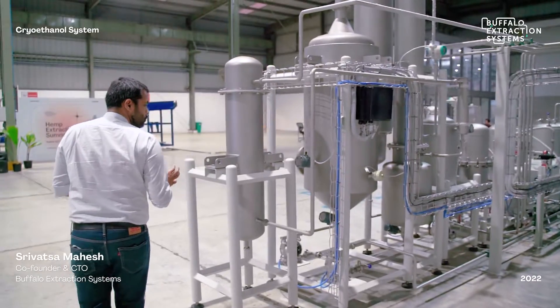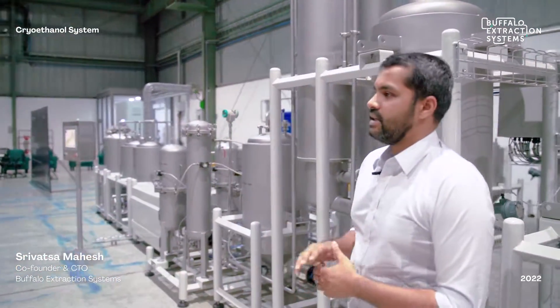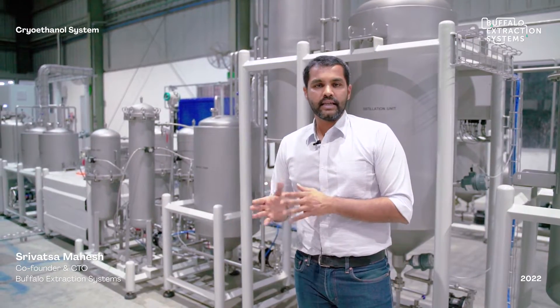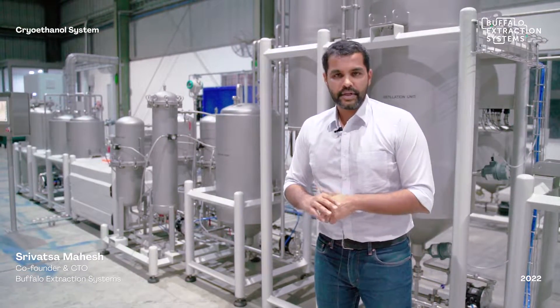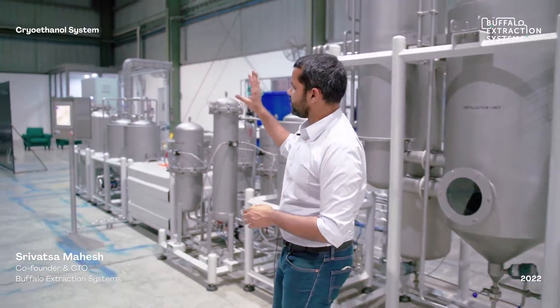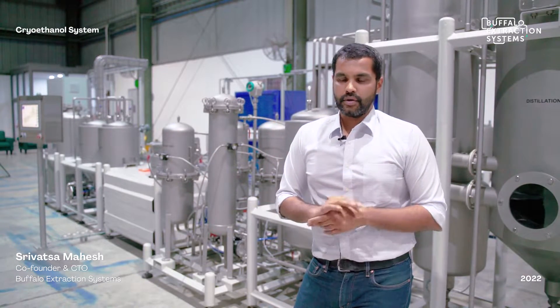This level 1 system processes 5 kilos per batch with a production capacity of 50 to 80 kilos per shift — a large capacity for a small footprint enabling robust operation. The system is fully controlled through an HMI with SCADA connectivity, so all recipes, wash cycles, and spinning cycles can be set, and recipe data and data logging ensure tracking and traceability throughout the process. For more information, visit www.buffaloextracts.com.